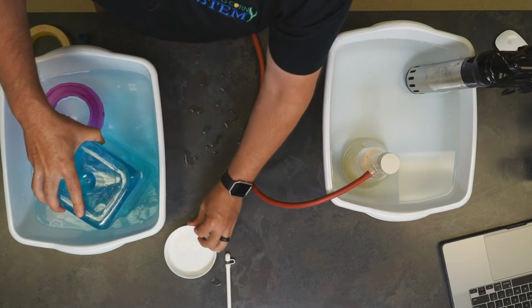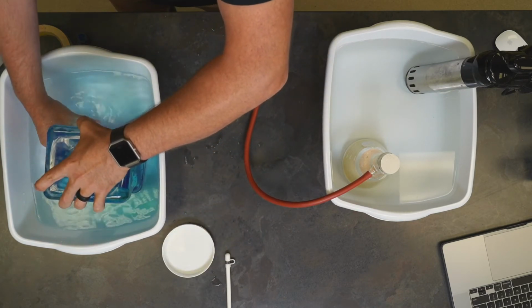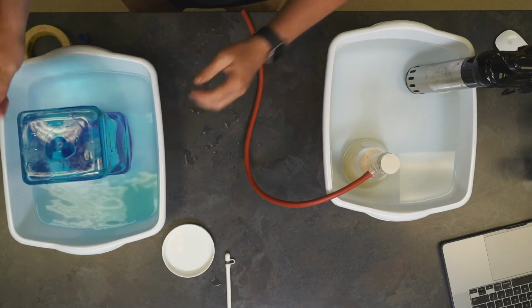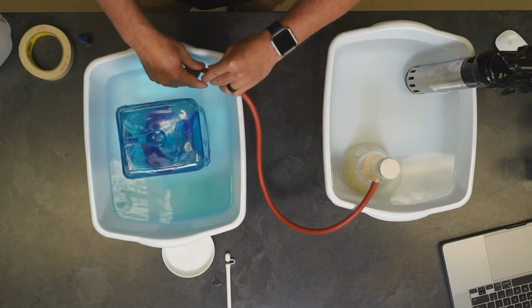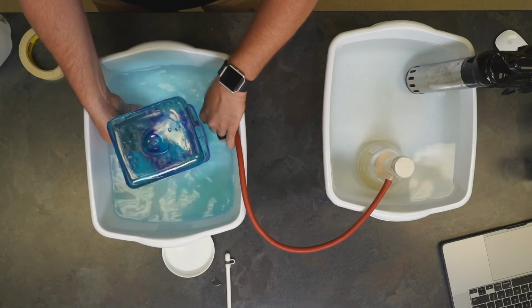Take the lid out now. And this is going to set on top of this little purple ring. Right now it sets down pretty good because there's a lot of water weight on there. As we displace that, it will tend to want to float. So pull it over here a little closer. And there are 4 holes for the tubing to go through.